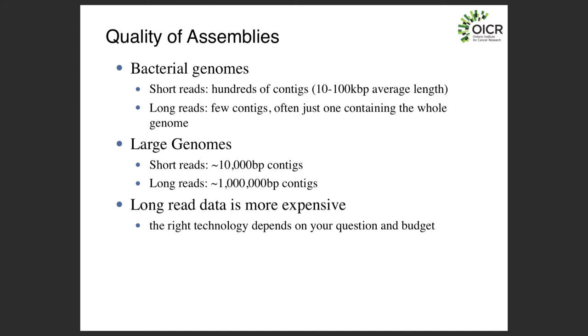Was there another question? Yeah. About the motivation of doing assemblies to begin with, can you give an example of why I would want to use assembly versus a reference genome? Sure. Well, the best example is if you don't have a reference genome, and that's the primary use. There are a lot of bacterial genomes that haven't been sequenced before.